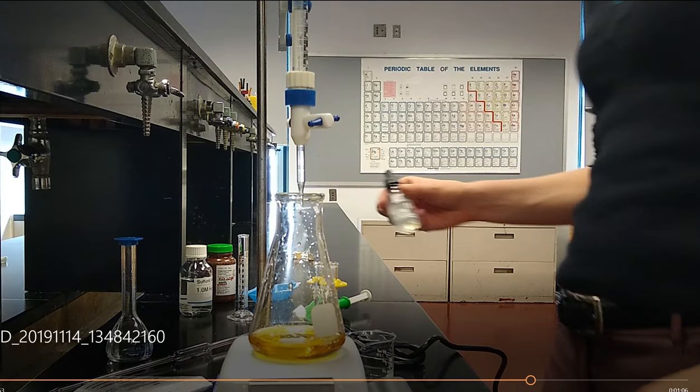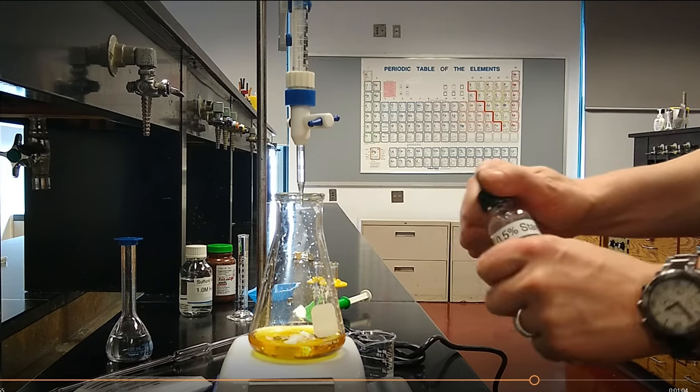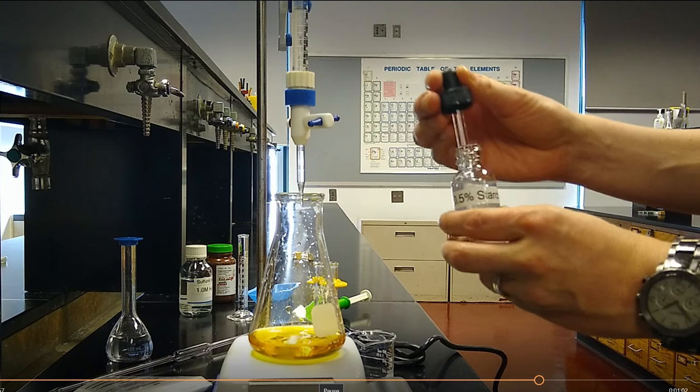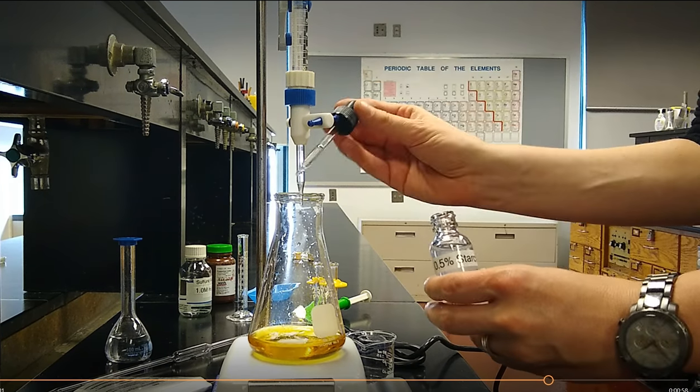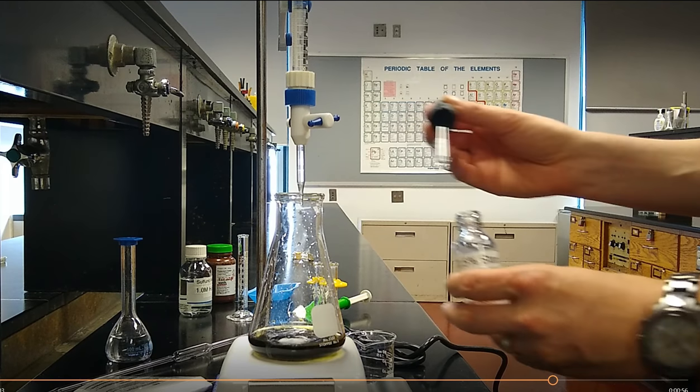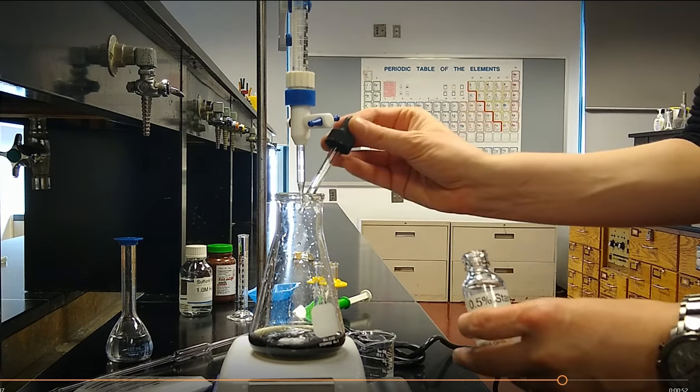Ultimately, this is going to turn clear. It is very, very difficult for most people to detect the color change from extremely pale yellow to clear. Here's where our indicator starch comes in. Go ahead and just get a dropper full of starch, and you're going to add the entire dropper full. So over that second arrow, write starch, and needless to say, the resulting color is black.